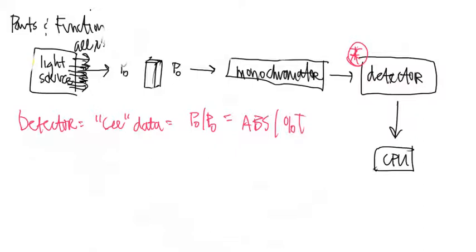All right. So the detector is made a certain way, and quite honestly, the detectors in spectroscopy are all very similar. Once you learn how the detector works in this machine, that's typically the detector that's used in every one of them, at least for the majority of the pieces that we'll talk about this semester.